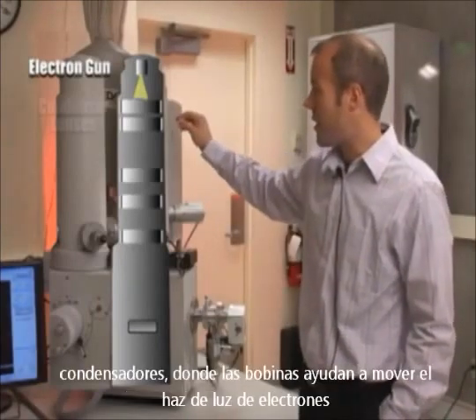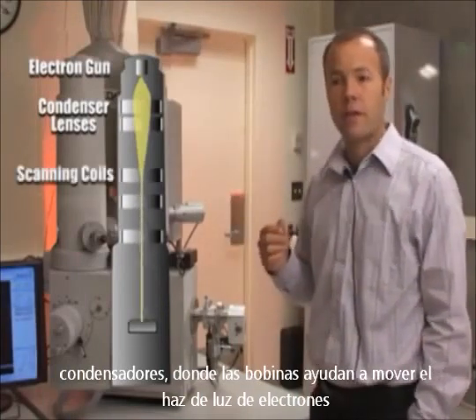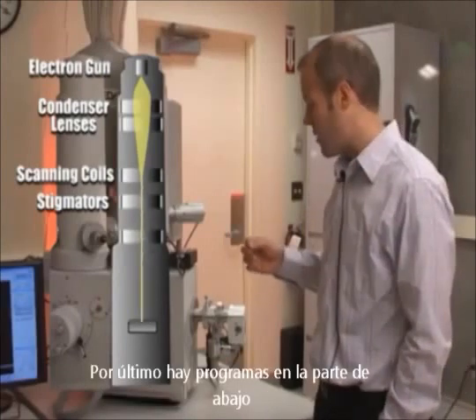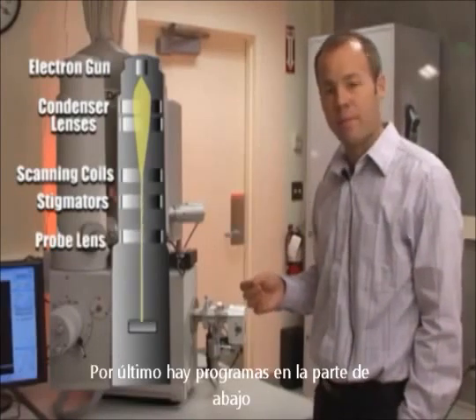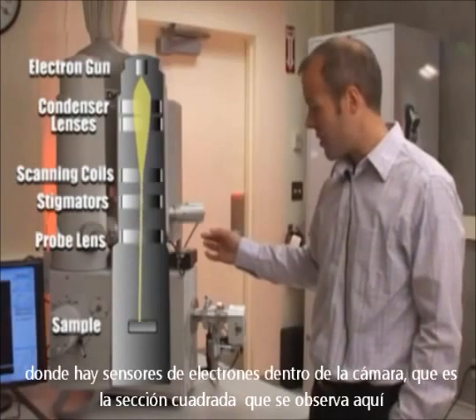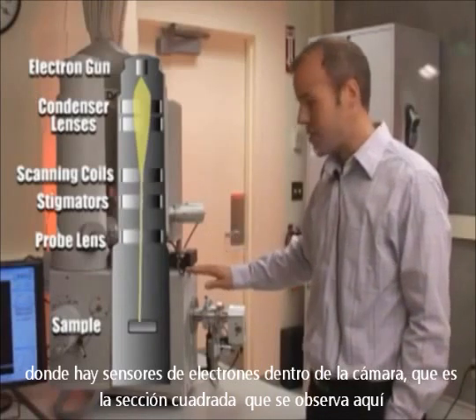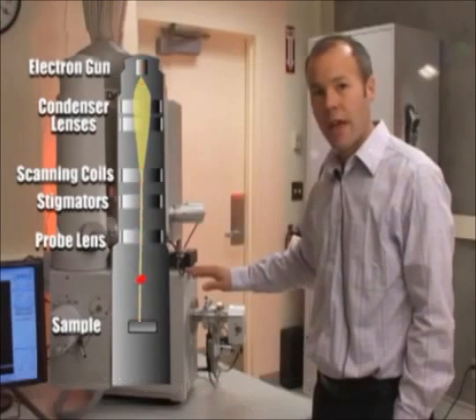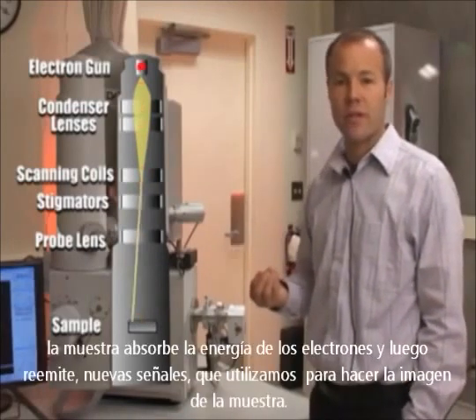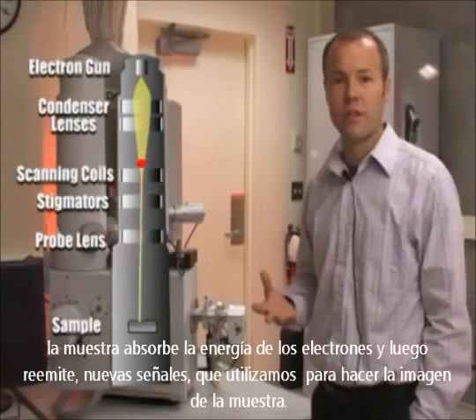Below the electron gun there are condenser lenses, scanning coils for moving the beam, stigmators for adjusting the roundness of the beam, and ultimately there's a probe lens at the bottom, down at about this level. When the electron beam exits from the probe lenses, it then enters the chamber — the square section here — and it impacts the sample, where the sample absorbs the energy of those electrons and then re-emits new signals that we use to image the sample.